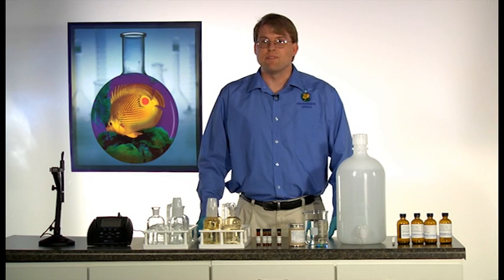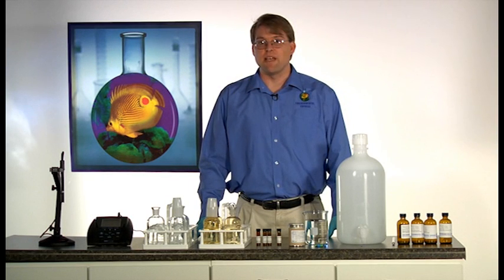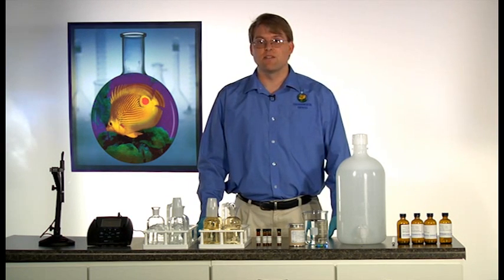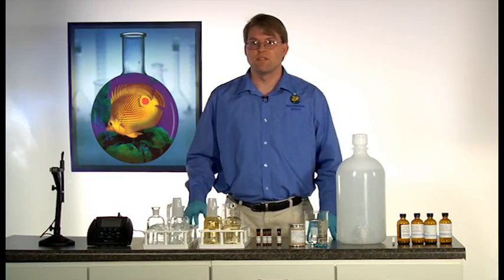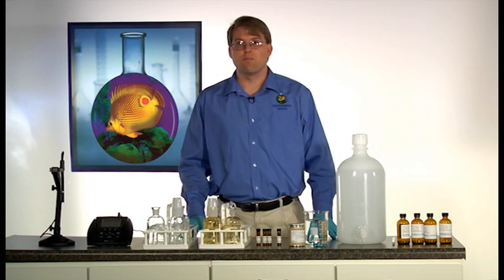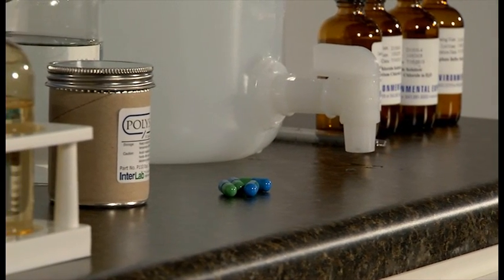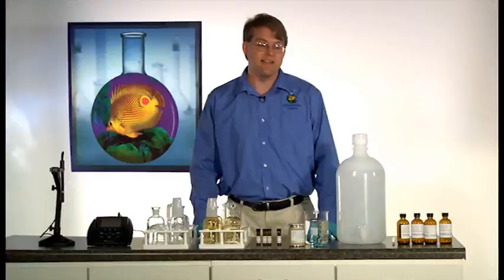BOD has many steps that are necessary to fulfill in order to obtain a good passing batch of samples. From the dilution water reagents to the bottles, Environmental Express provides several products that are designed to make your setting up of a BOD batch quick and easy.